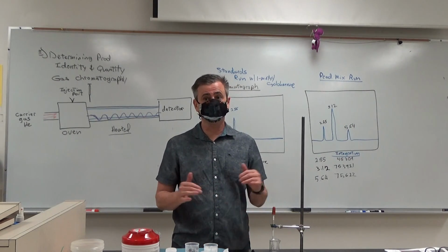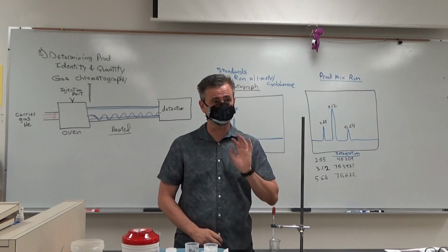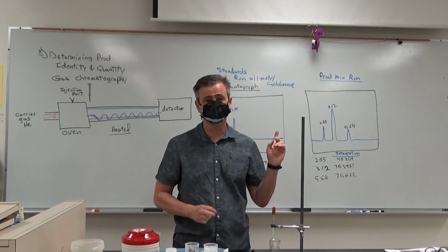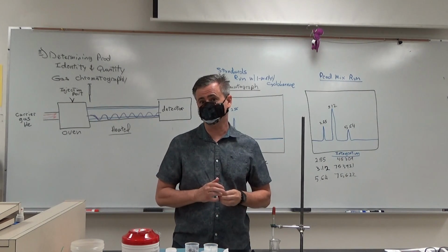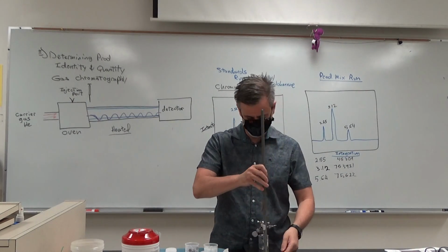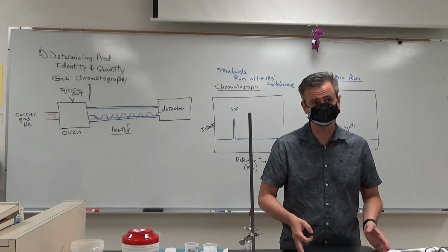Now, all chloroform stuff has to be done in the hoods. We've got 4 hoods, that means 4 people at a time can do it. In a second, I'm going to come up with an order of when we're going, okay? And then we'll let those folks go. And you may just have to study a little OChem while you're waiting.